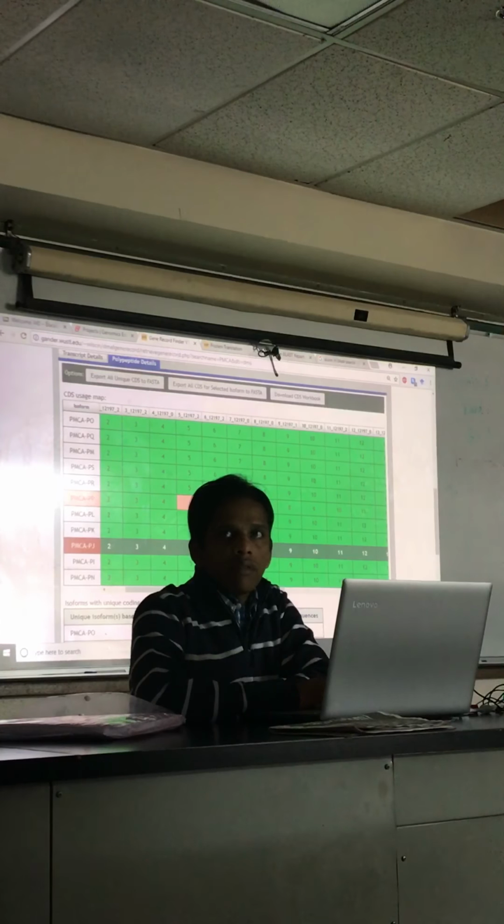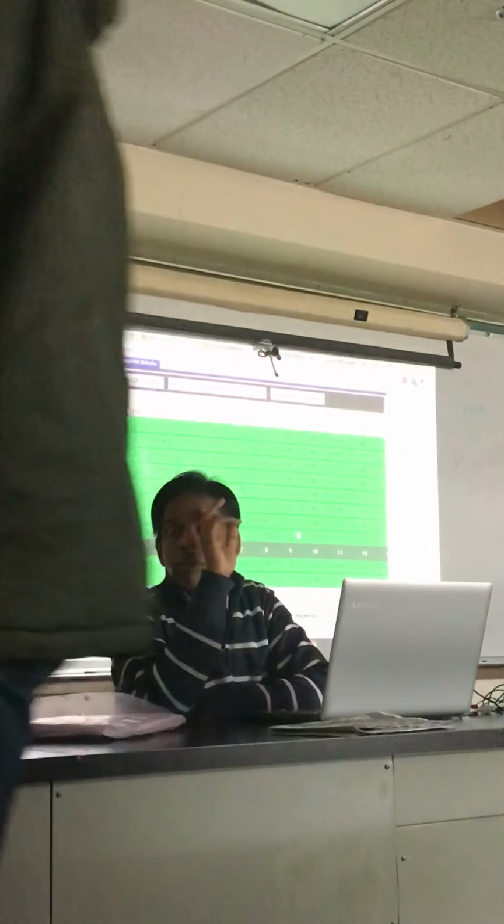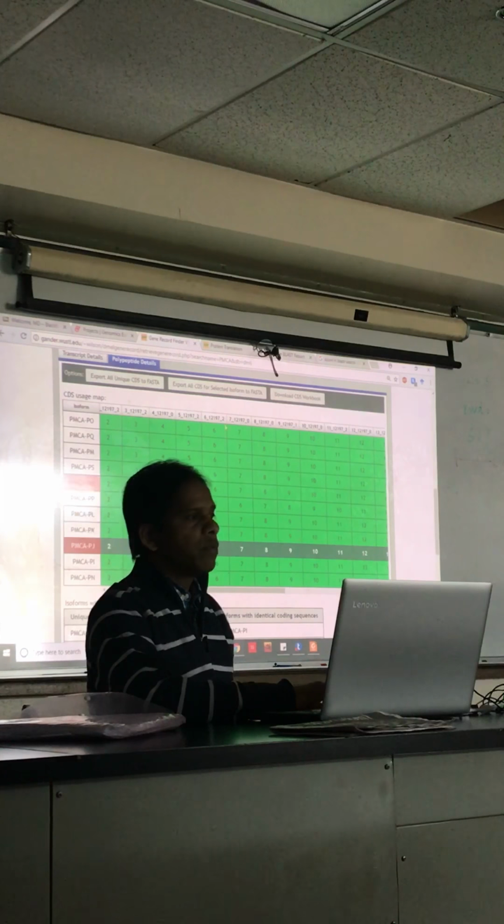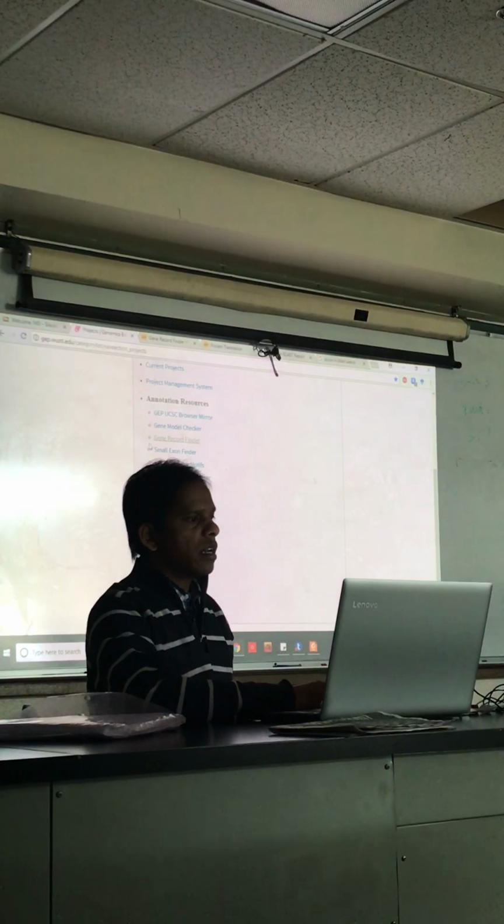Do you see that from there? You didn't get it? Go to Gene Record Finder and write PMCA. Or if you go to this side, the project, and then click under the annotation resource tab, there is a Gene Record Finder.